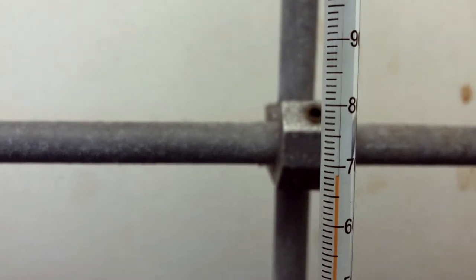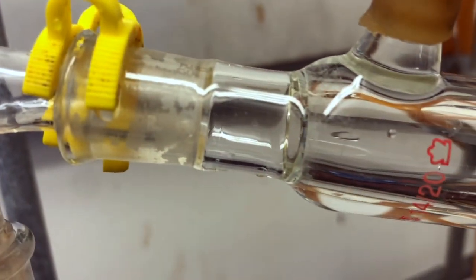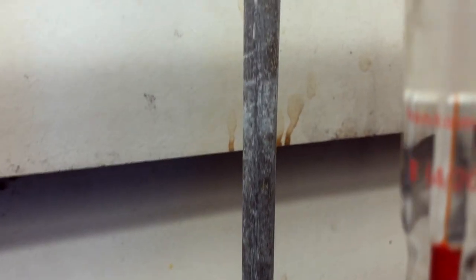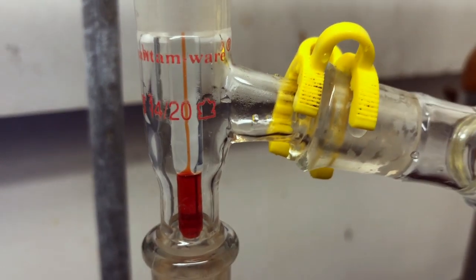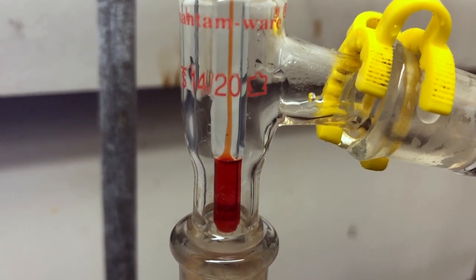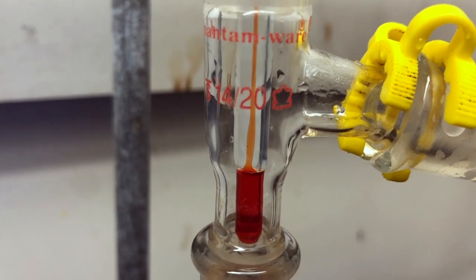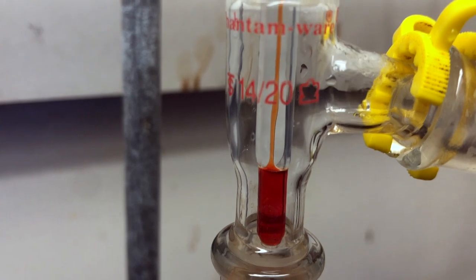Once those first few drops came out, the temperature started to rise above 70 degrees. We started to see a little more condensation near the condenser and the sidearm of the distillation head. At this point we get ready for our main fraction. You can see the reflux line just at the level of the sidearm of the distillation head. The reflux line is important to watch because it tells you exactly where the vapors have reached in your apparatus.